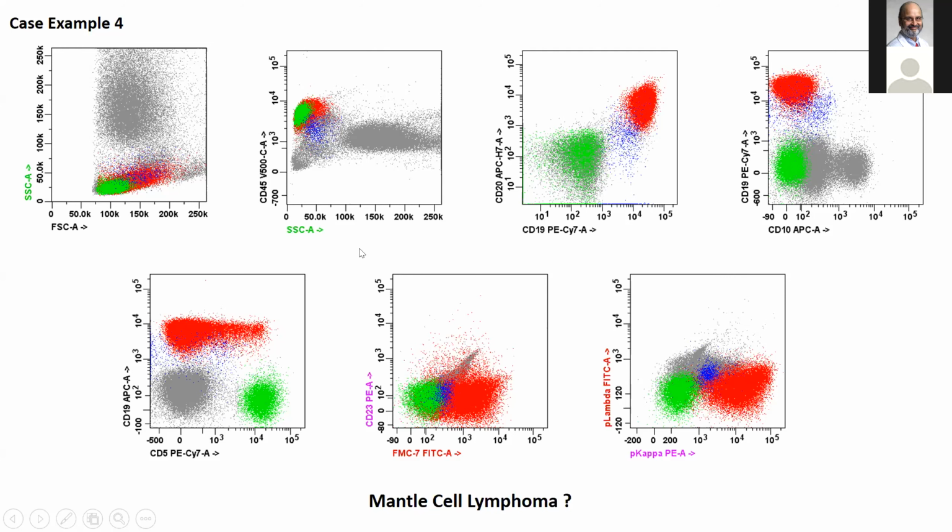All right, so looking at the immunophenotype for the red, I would be suspicious, could this be mantle cell lymphoma? Because it's partial positive for CD5, it's bright positive for CD20, bright positive for kappa, and then it's got FMC7 and lacks CD23. So that looks like it could be a mantle cell lymphoma. The thing is, most mantle cell lymphomas are nicely positive for CD5. That doesn't mean you can't get partial positivity in mantle cell lymphoma. It's just something that catches your eye.